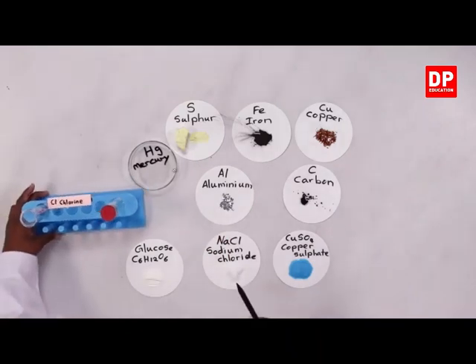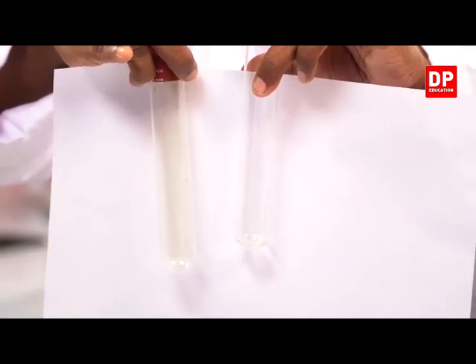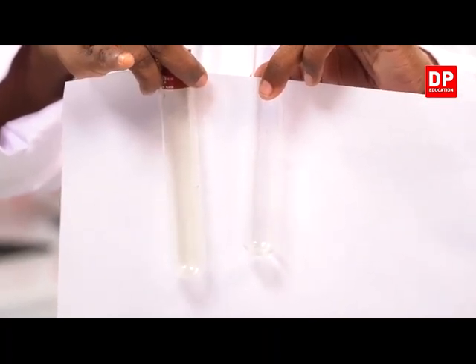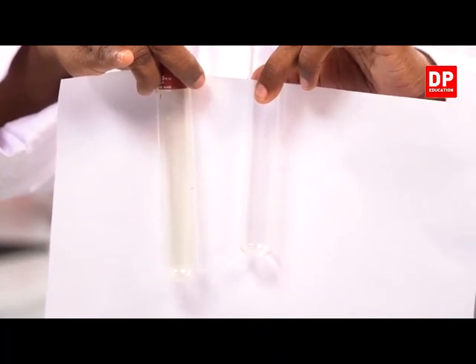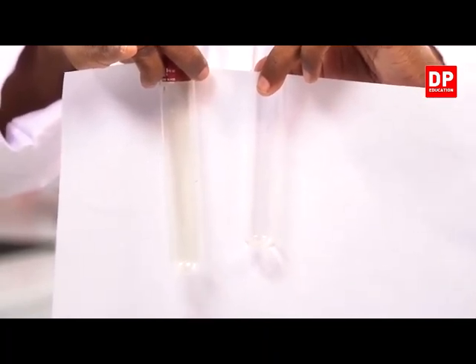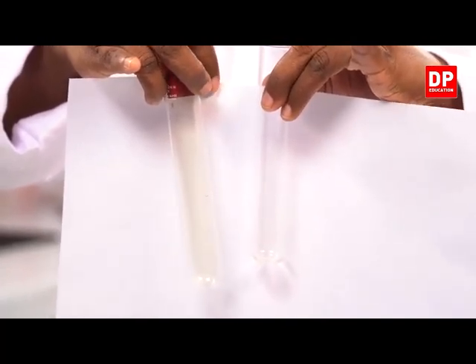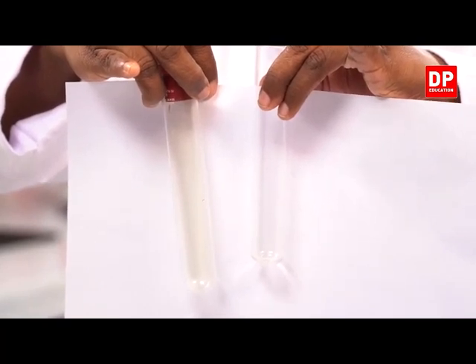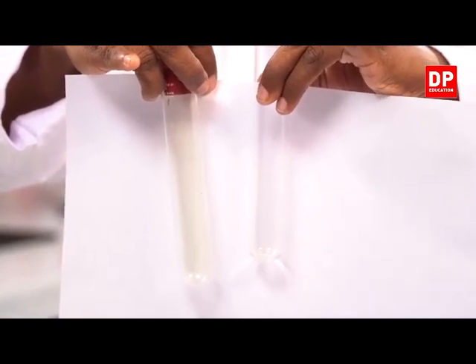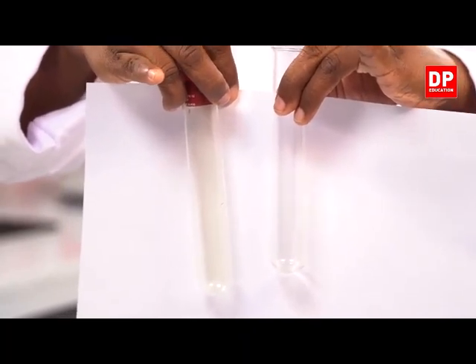Then I have here the chlorine gas. So now here students, can you all see, I have taken two boiling tubes so that you can compare. On my left side, it is an empty boiling tube and on my right side you can see the boiling tube that contains the chlorine gas. So you can identify it as the greenish yellow color gas.